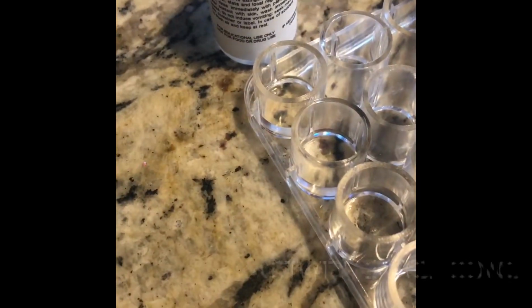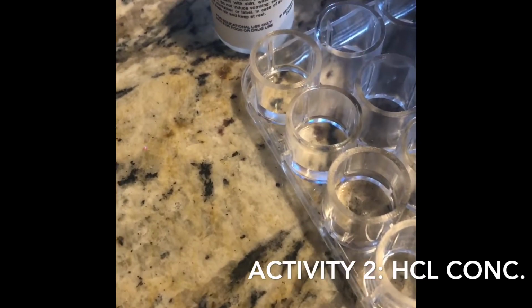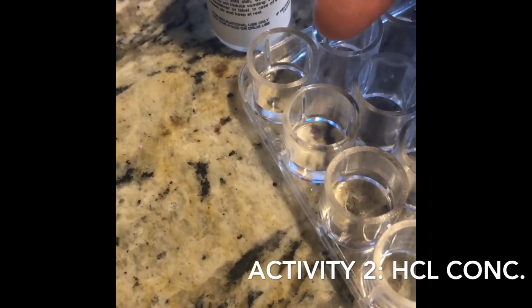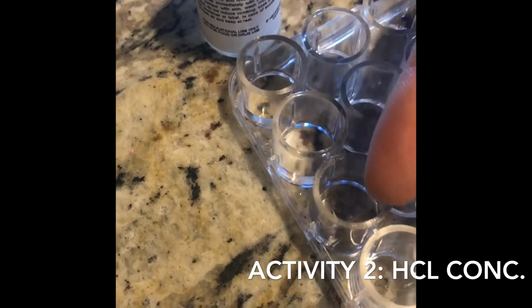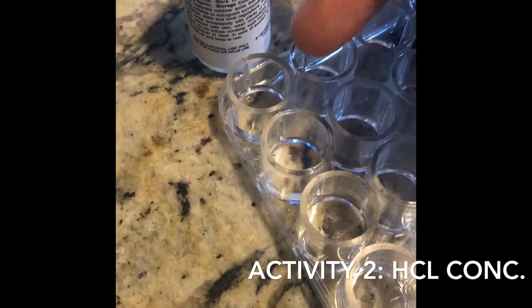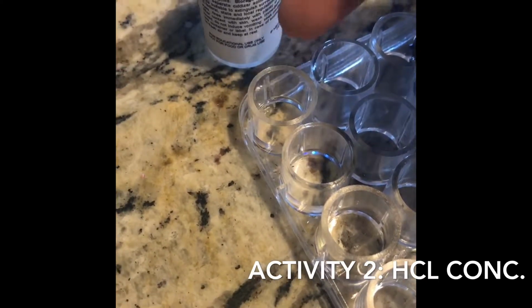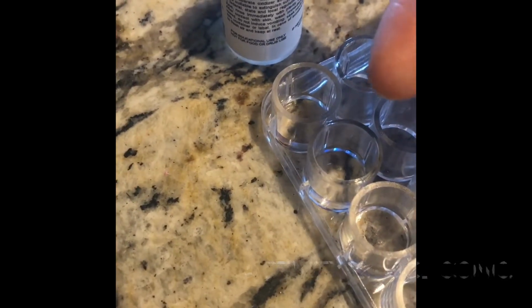All right, so this is for the HCl concentration. We've got our hydrochloric acid, 0.1 molar, and we've done 15 drops here with 5 drops of pure water, 10 drops here with 10 drops of pure water, and 5 drops here with 15 drops of pure water. This is the 25, 50, 75%, and then of course the 100% we'll use this. And it will continue down as we do our wells, and we'll see what the reaction is.